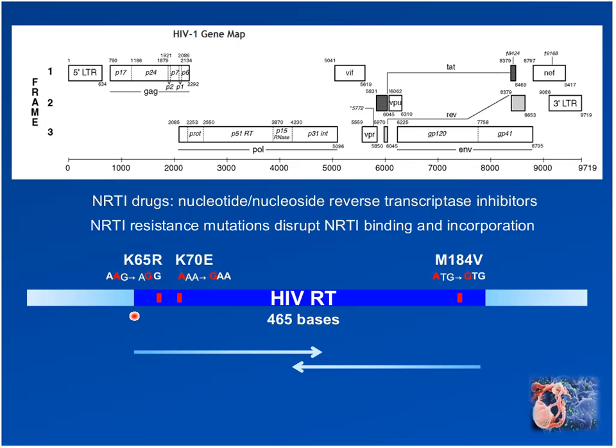We have reads spanning the forward and reverse strands of the amplicon molecules that were used to sequence on the GS FLX Plus. And I have this little reminder here for myself at the bottom just to say that on the MiSeq, we cover the same target region with paired end sequencing. So we get a 250 base read for each molecule in the forward direction that pairs with a 250 base read in the reverse direction with about a 35 base overlap in the middle.